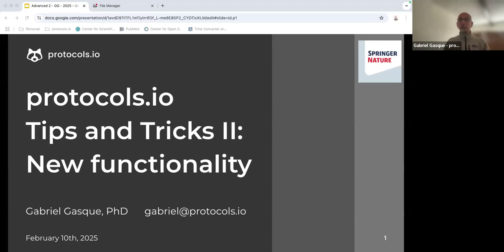This is not an introduction to protocols.io, and therefore I will be assuming some familiarity with the platform. But in a few slides, I will be sharing some links where you can find other, more basic webinars if you are just starting to get your toes wet with protocols.io.